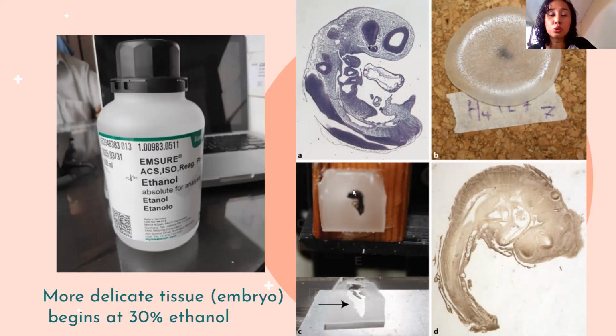So, guys, this is a tissue block. Kanina I told you about orientation. It's very important, guys, na yung pag-orient mo, yung pag-ayos mo dun sa tissue mo, nakalabas yung tissue, ha? Pag masyadong nasa loob, mahirapan kang mag-trim, mahirapan kang mag-cut kasi ang layo-layo ng pinaglagyan mo.